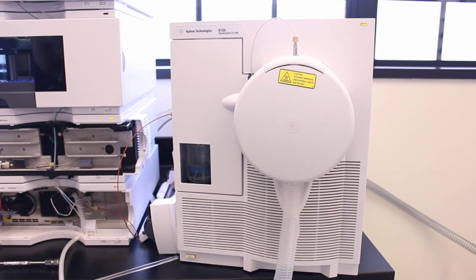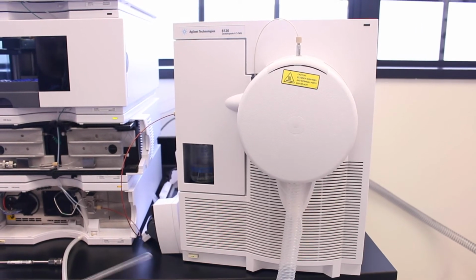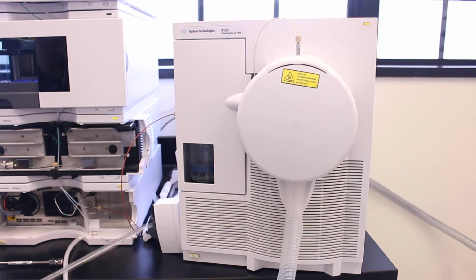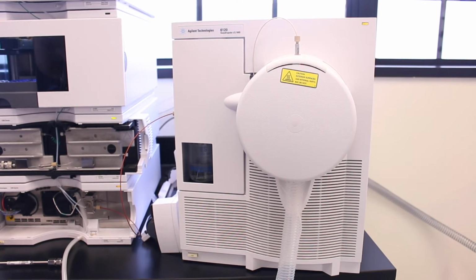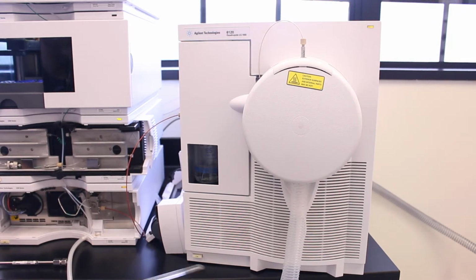This mass spectrometer uses something called ESI, electrospray ionization. And it's a so-called soft technique. So it's not going to fragment the molecule. It's much more gentle. So you don't really see fragments in your molecules here.